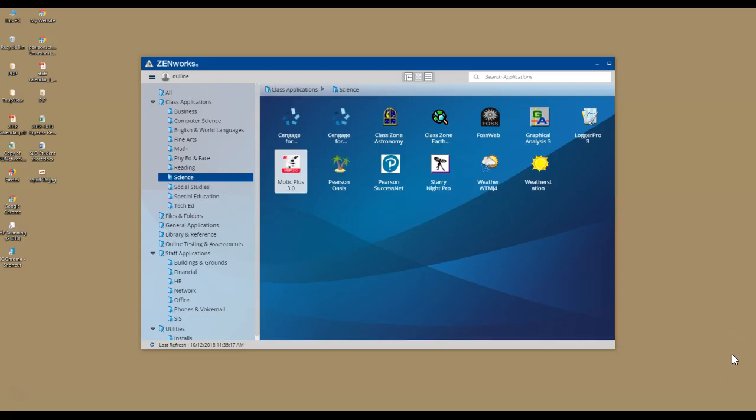Hello class. This is the first of 3 short videos to review how to use the Motic microscope digital camera along with the software app that's associated with it. I will have already gone through all of these things with you in class, but I've created these short tutorials just to remind yourself on how to do some things if you forgot, because there's a lot of steps involved sometimes with using this.